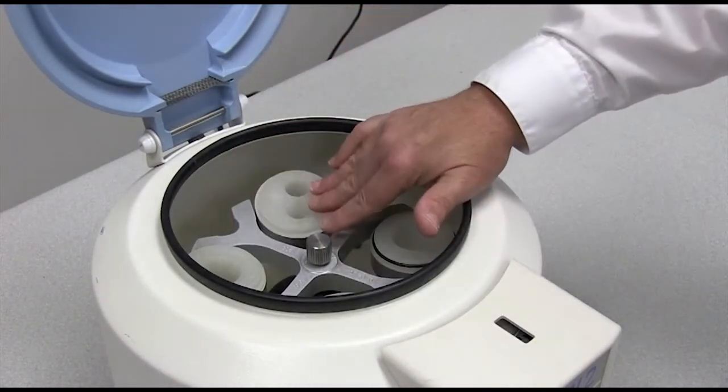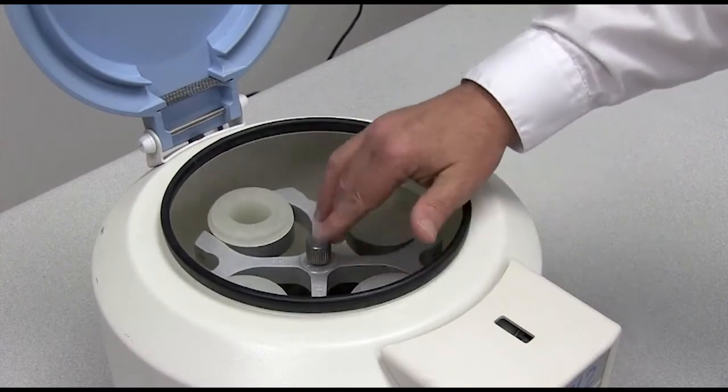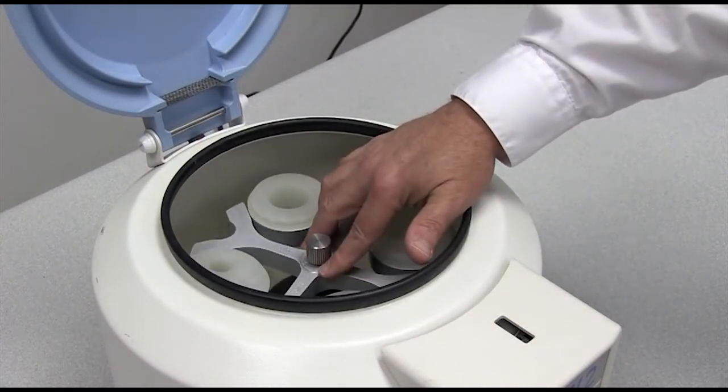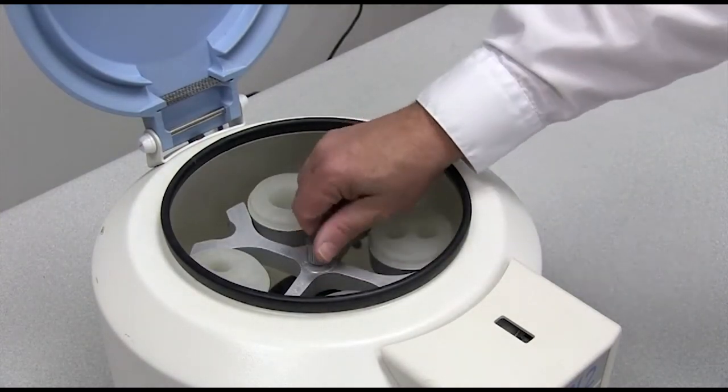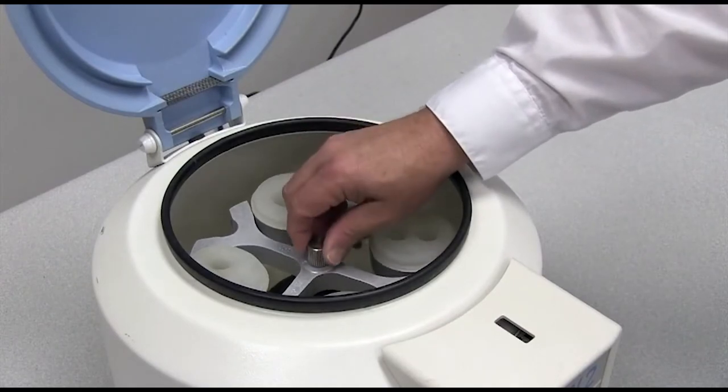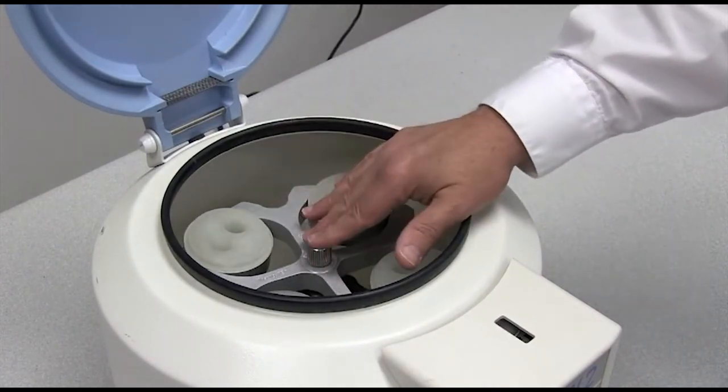And so this is, like I say, a typical centrifuge for handling cells.